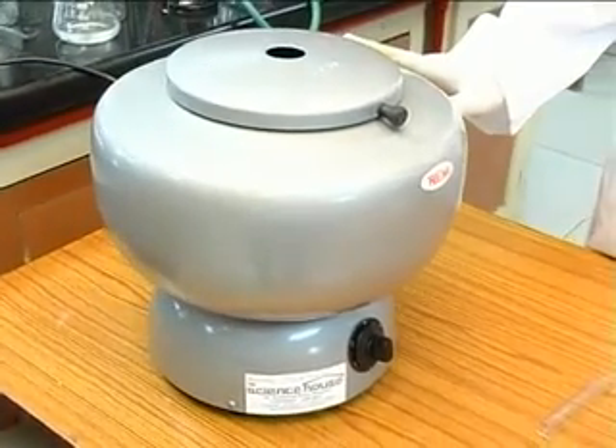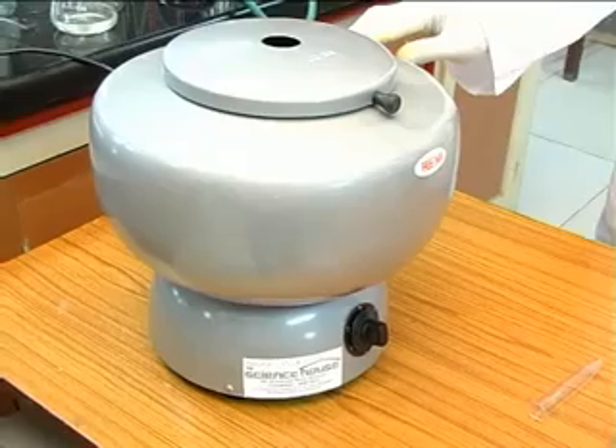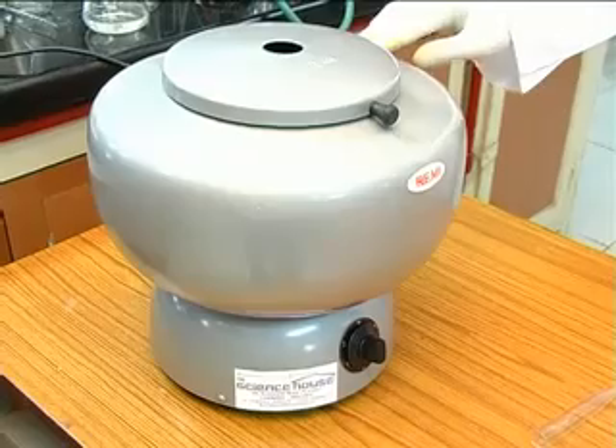A laboratory centrifuge used to separate solids from a liquid mixture is shown here. It is about 1 foot high and about 1.5 feet in diameter at the top.